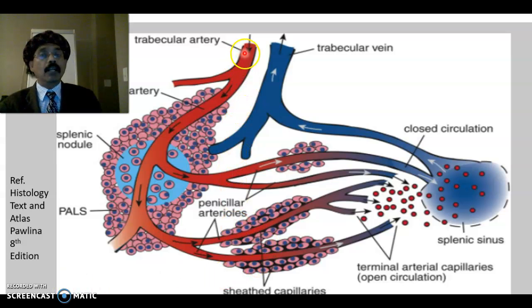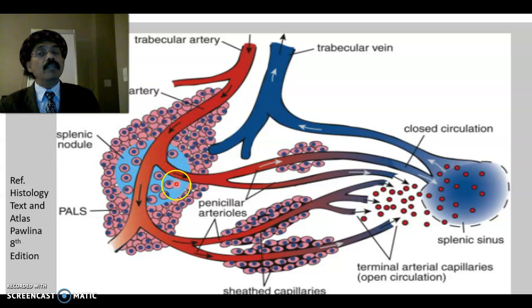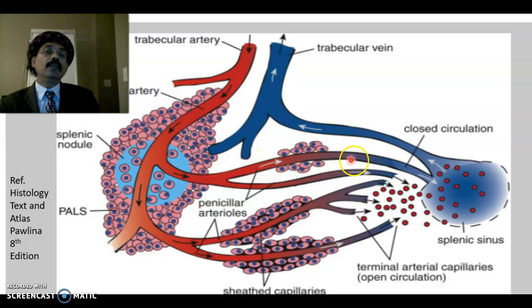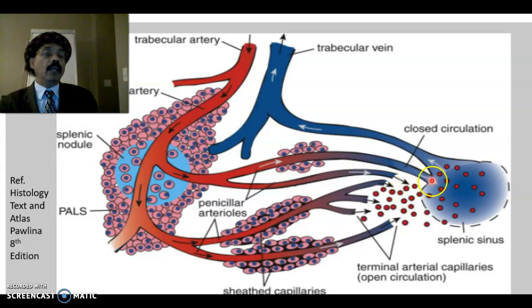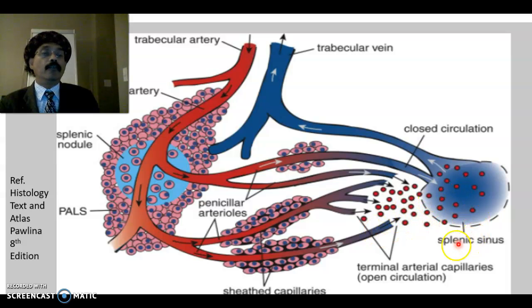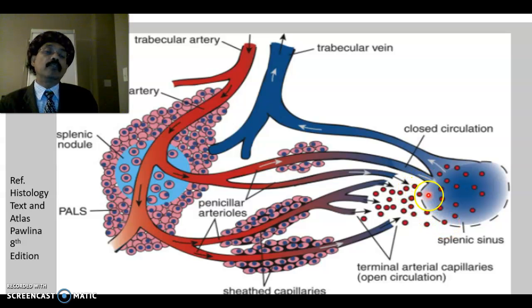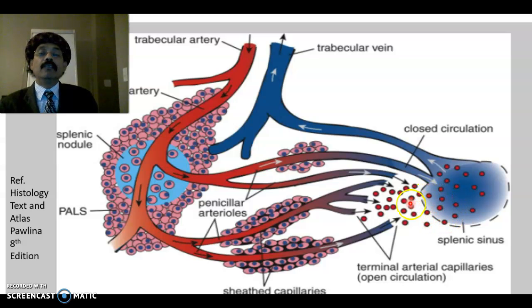This is the trabecular artery going through the lymphatic nodule. The lymphatic nodule has a germinal center area containing B lymphocytes, and at the periphery we have T lymphocytes. This artery goes to the splenic sinus; in humans it opens into the lymphatic cord in the reticular substance, then blood percolates between the endothelial cells of the splenic sinusoid. This is called open circulation.